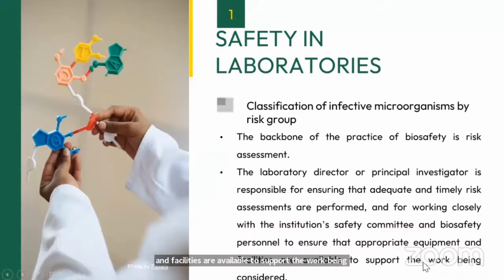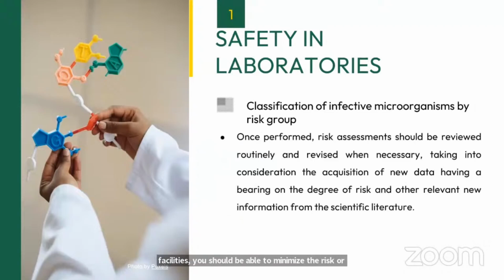So whichever work you are performing, depending upon the risk level, you must assess those areas, and with the help of your safety committee, your institutional policies and protocols, and appropriate equipment and facilities, you should be able to minimize or eliminate the risk in those areas.